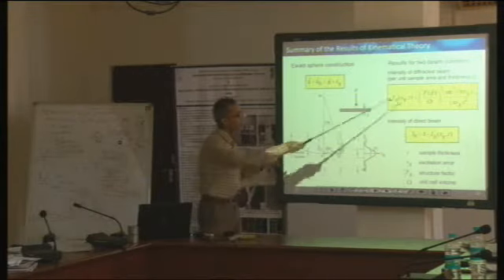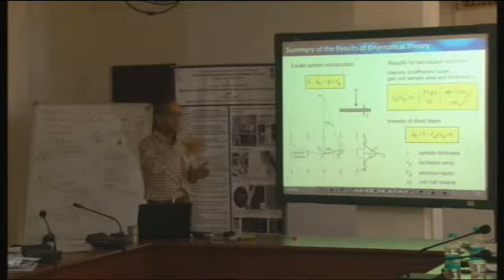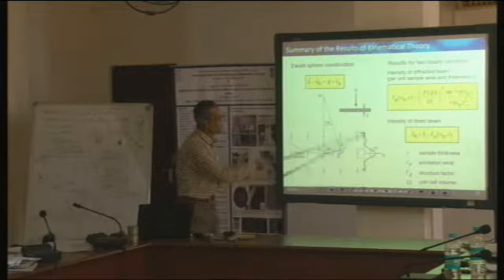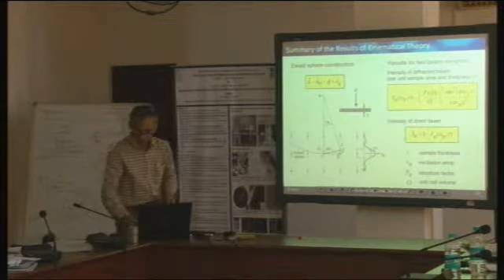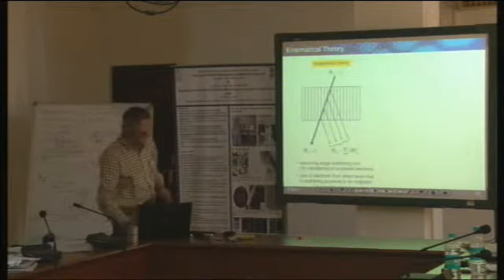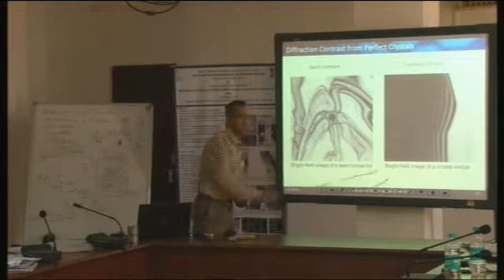This sine function is there, so there will be periodicity. So in the same manner, as T increases, you are going to get a similar thing, and that will be thickness. So those are the two factors which we saw. So this was the bend contour, and this was the thickness fringes.